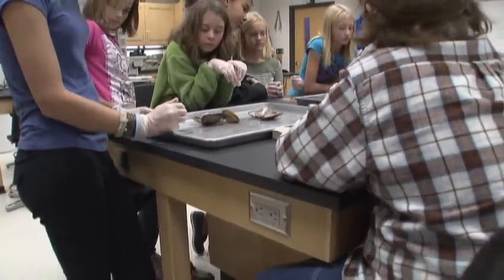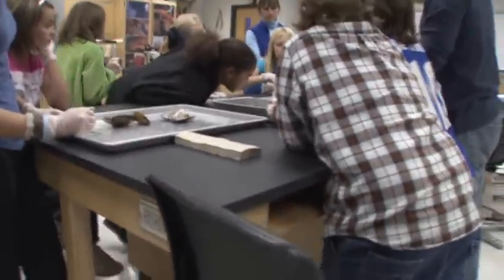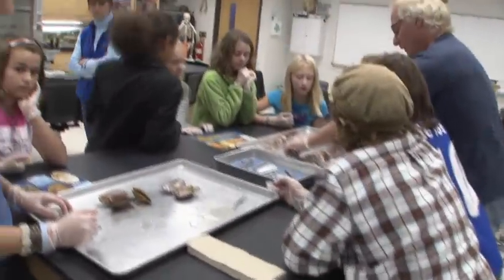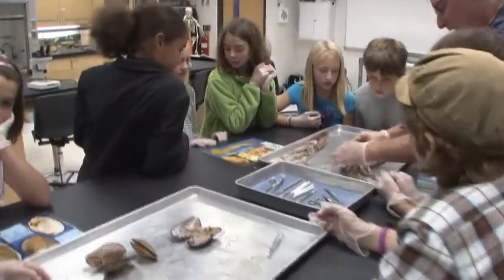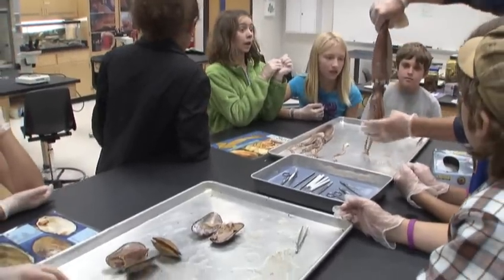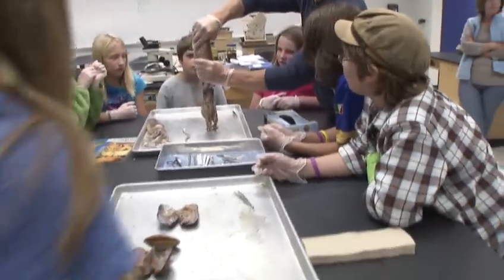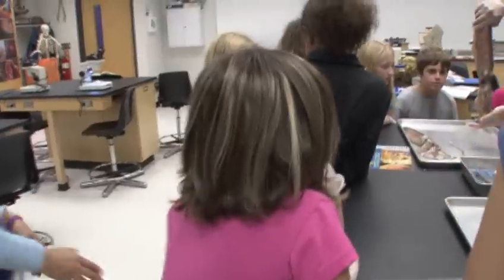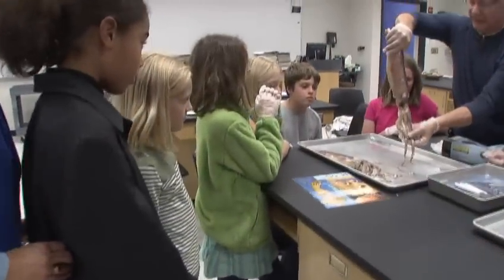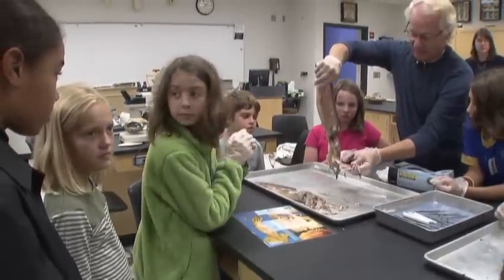But these guys over here, these guys are predators. So these are quite different. These are squid, and this actually came off. I don't know why it came off, but it did. These guys used to be like this, right? Because this would be the dorsal part up here. This would be the ventral part, because these are from the modified foot. These are all tentacles and arms now. 2 tentacles and 8 arms. The tentacles are longer, and they're kind of modified. You can see the suckers on them.